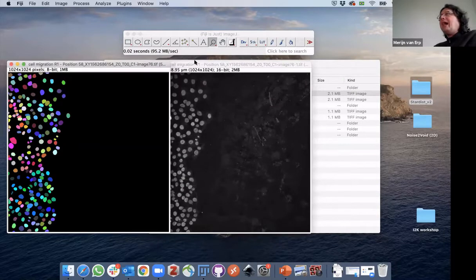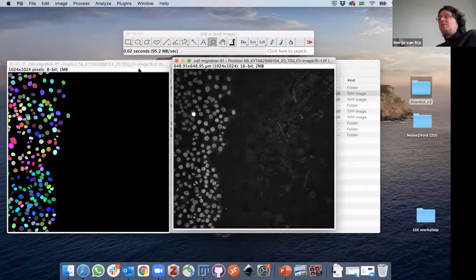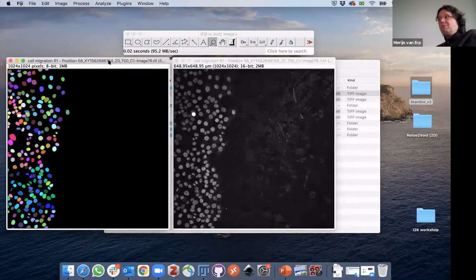How is that resolved between the different images, and how does that work in the deep learning consensus? Because I can imagine that you can say, okay, I want this to be number one and this to be number two, but that doesn't fit between images, right? The number one class isn't the same thing in each image.